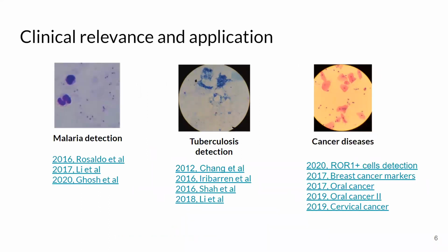Such high quality of imaging demonstrates the relevance of mobile microscopy application in many diseases important for humanity. They include mass diseases like malaria and tuberculosis in developing countries, where fast and cheap diagnostics with mobile microscopy may help a lot, as well as different cancer diseases, a field where timely diagnostics may save a lot of lives.